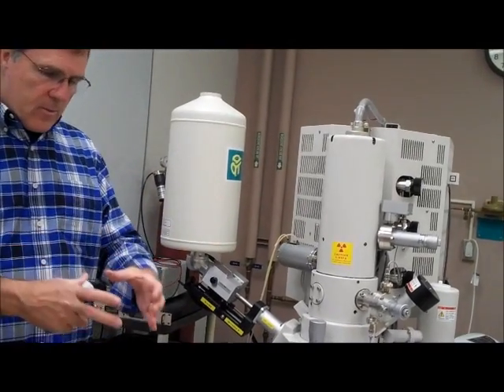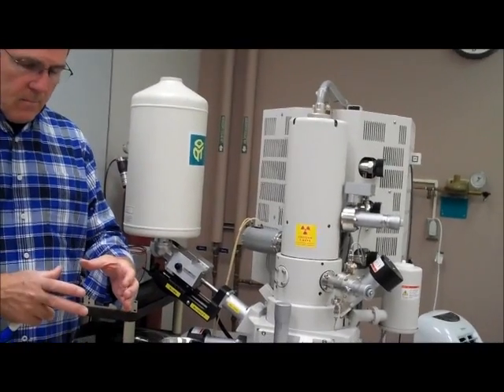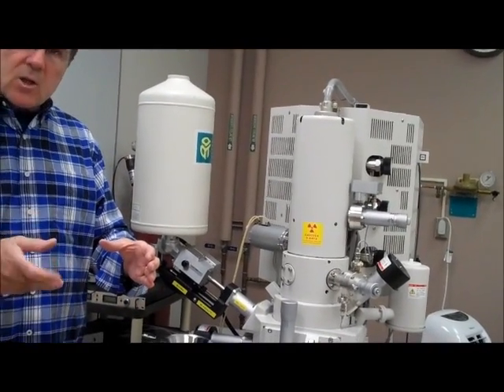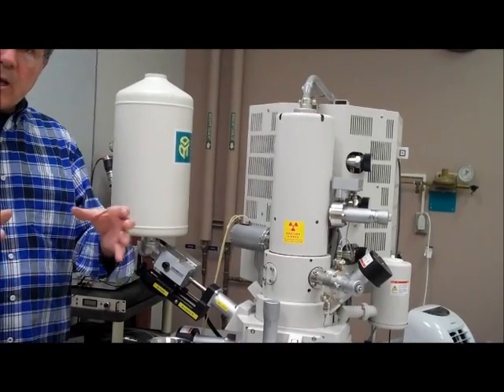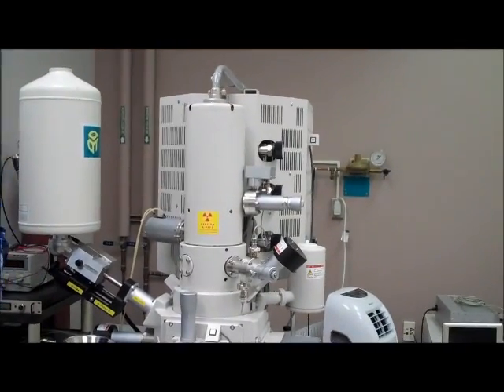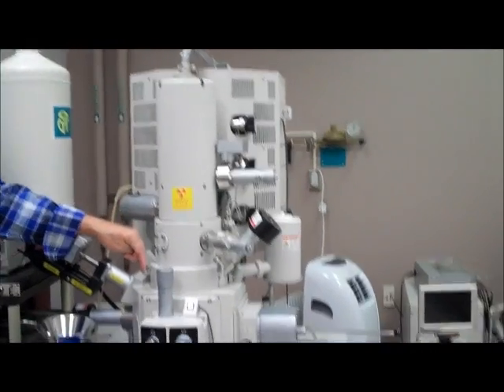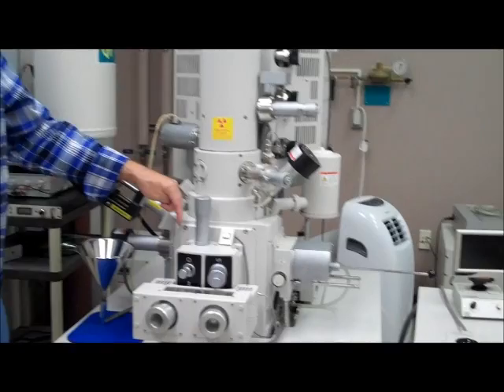And so they're basically a doughnut that's a coil of wire, and as you change the current that runs through that wire, you can push that beam of electrons around. And so then the beam goes down through the column, through the lenses, there's two.